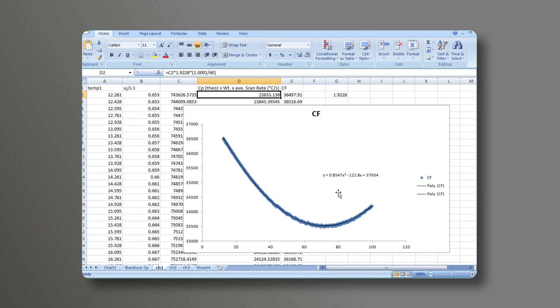The values of these fits, or the coefficients, are then used in the MCDSC run software. Where this would be coefficient A, coefficient B, and coefficient C. Those numbers that we previously changed to zero.